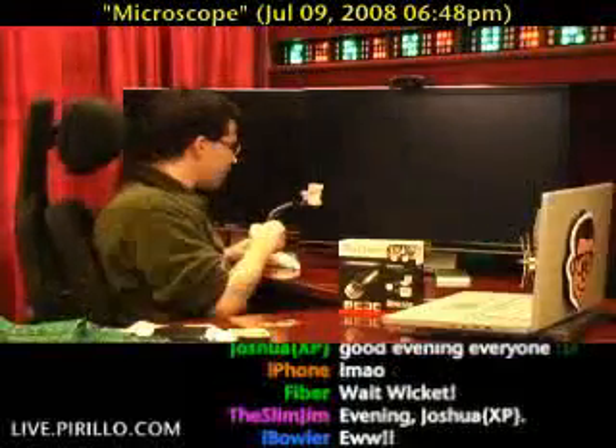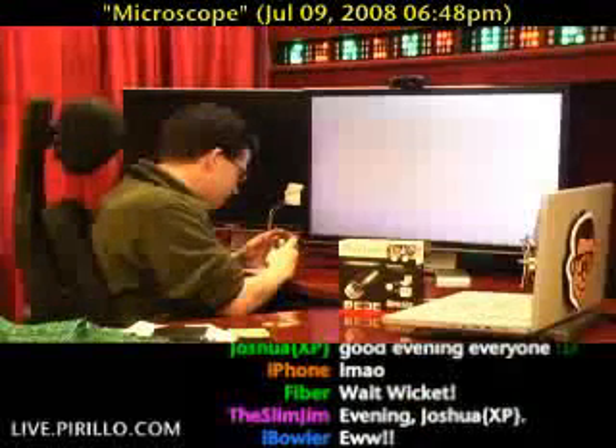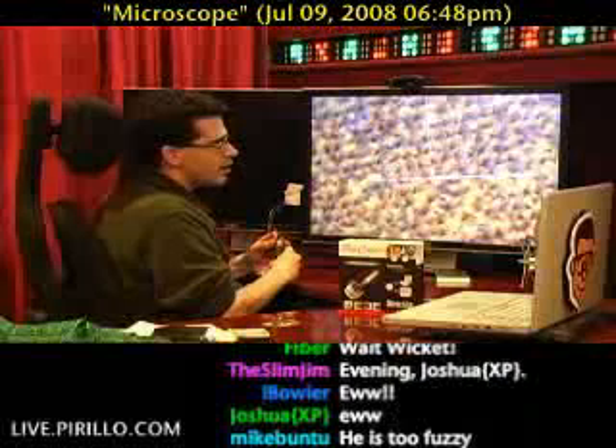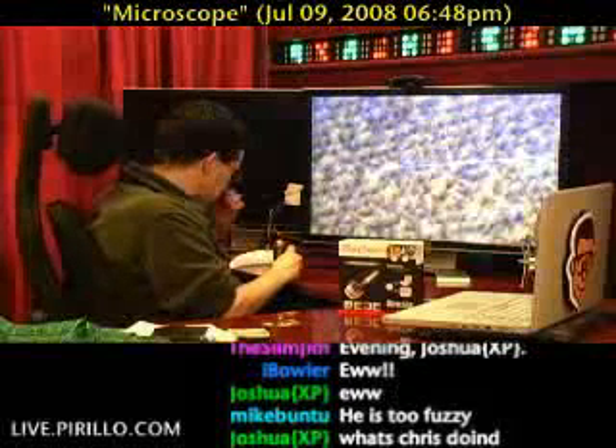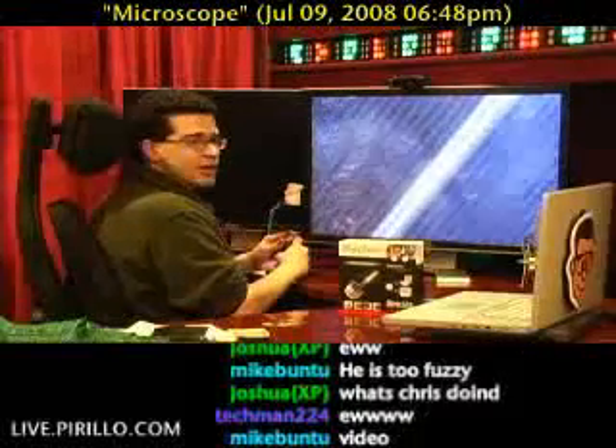All right, let's look at something far less disgusting. Let's look at my table. If you wondered if this was real wood or not, that should answer your question — it's obviously not real wood. Let's take a look at the iPhone. Let's turn it on. Zoom out, zoom in — RGB, RGB, RGB. Can you see it?